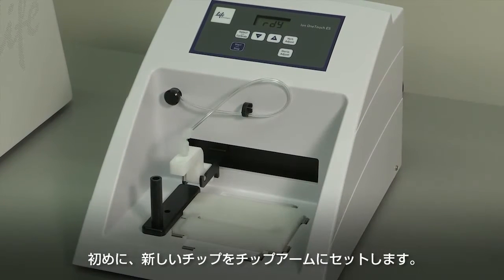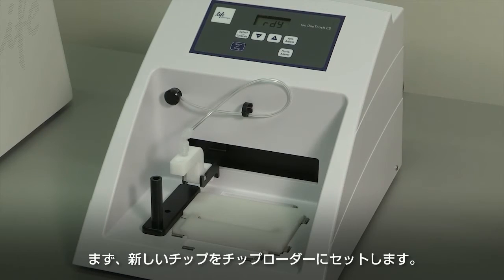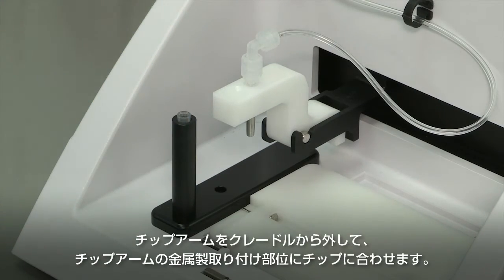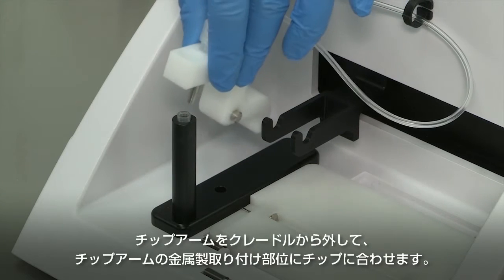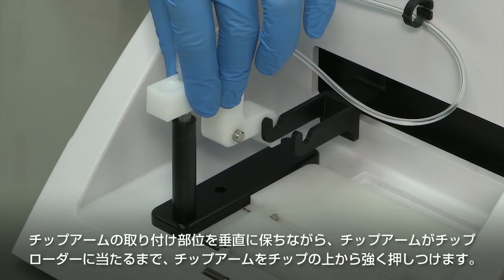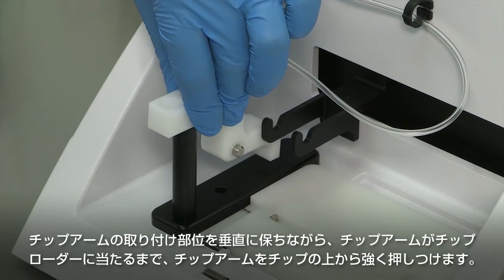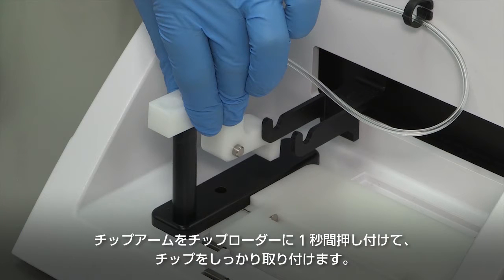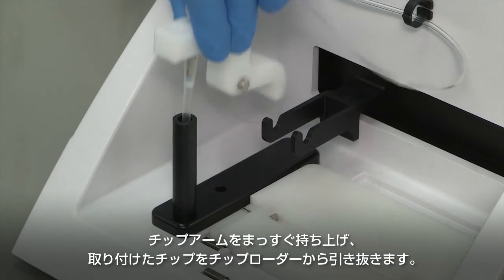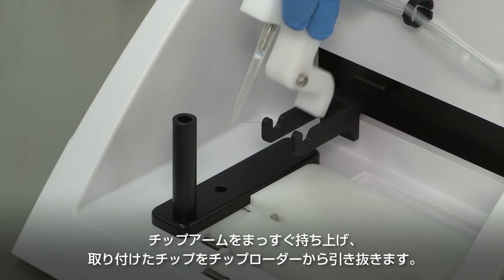We will first need to set up the ION OneTouch ES by loading a new tip in the tip arm. Place a new tip in the tip loader. Remove the tip arm from the cradle and align the metal fitting of the tip arm with the tip. Keeping the fitting on the tip arm vertical, firmly press the tip arm down onto the new tip until the tip arm meets the tip loader. Hold the tip arm to the tip loader for one second to ensure proper installation of the tip. Lift the tip arm straight up to pull the installed tip from the tip loader tube.